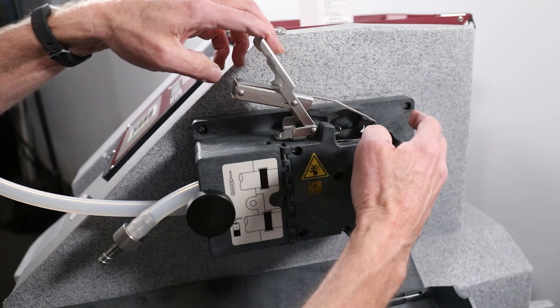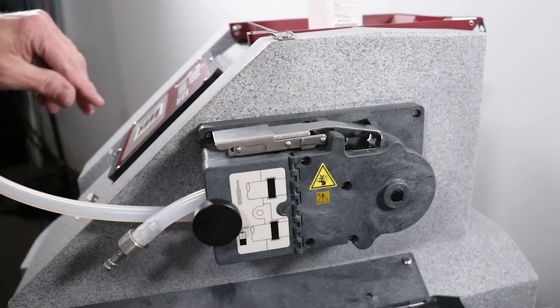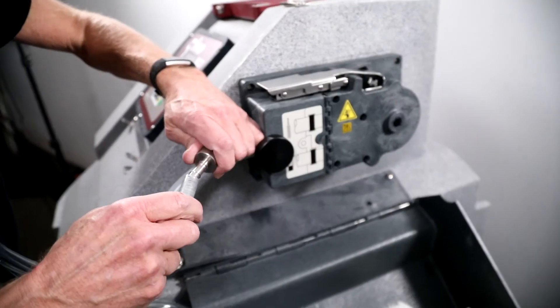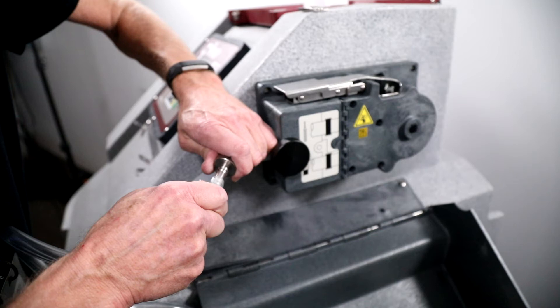Secure the pump band by connecting it to the band latch and pressing down to tighten the latch. Connect the lower pump tube end to the bulkhead fitting on the 5800 and connect the suction line to the tubing coupler.